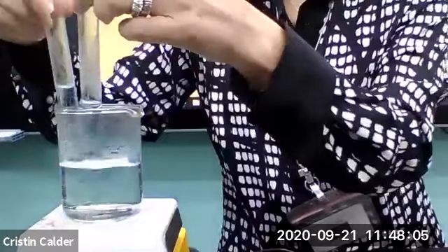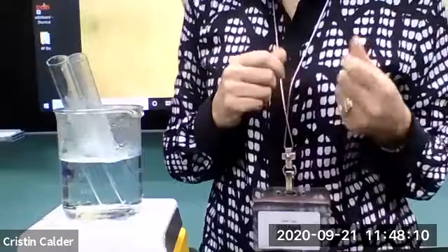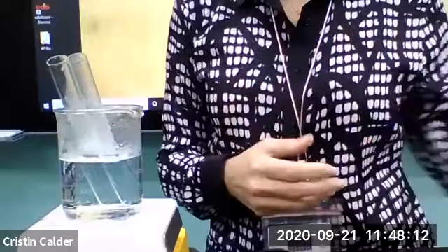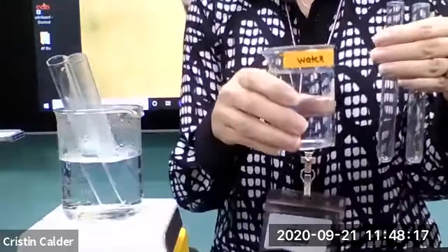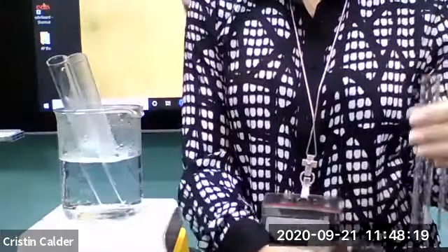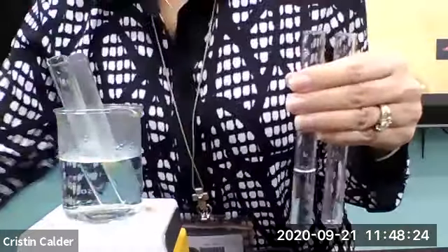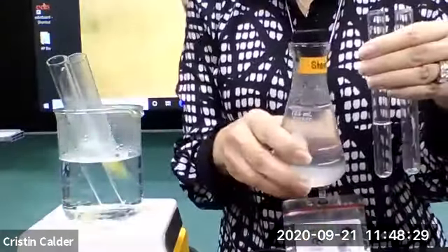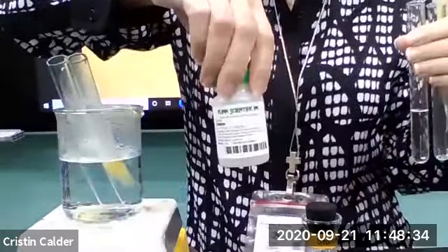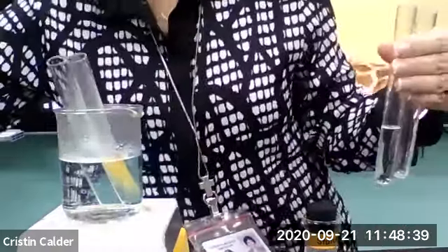So those actually need to heat for a second, so I'm going to let those heat. While they're heating, I'm going to show you the Lugol's test for starch. Again, I'm going to get 2 test tubes. In one of them, I'm just going to put some water. So here's my water. And in my second test tube, I'm going to put what I mixed up earlier today. This is some starch solution, literally potato starch here. So this is going to be my positive control, my standard for starch.